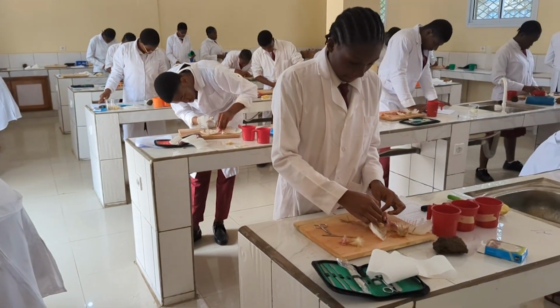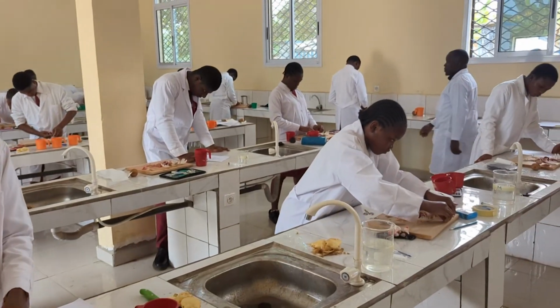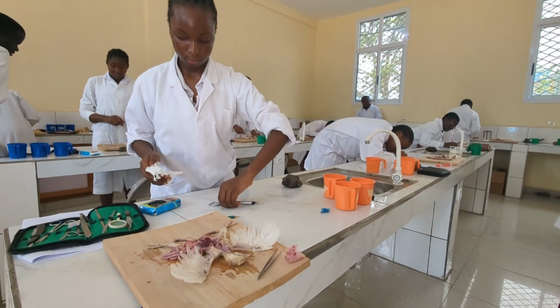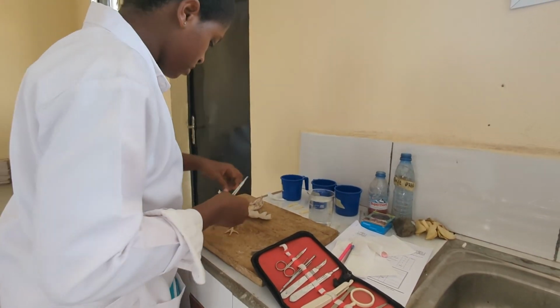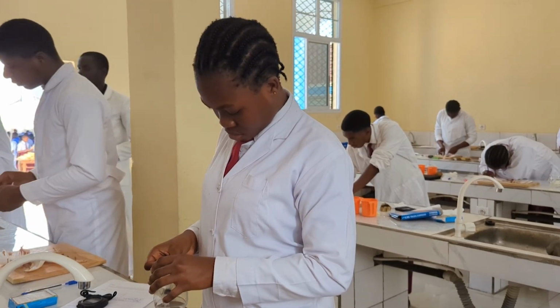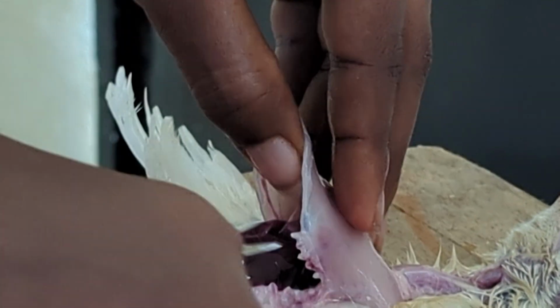Science remains one of the broadest fields in the academic milieu. It is believed that students who venture into this aspect of study are driven by passion. Visiting the science laboratory of CUIB Entrepreneurial High School in Molyko, it is a busy day for these upper sixth science students. The dissection of a chick is a practical exercise in which the students are engaged.